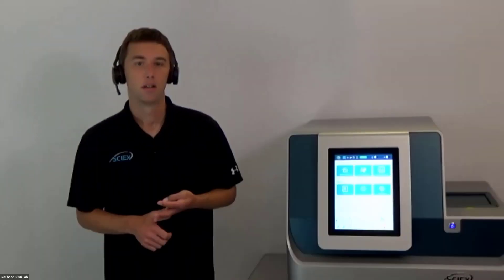Welcome to my lab here in Redwood City, California. My name is Peter Holper. I'm a senior application scientist here at SCIEX. I've worked for many years in analytical development within the biopharma industry within the CMC space.